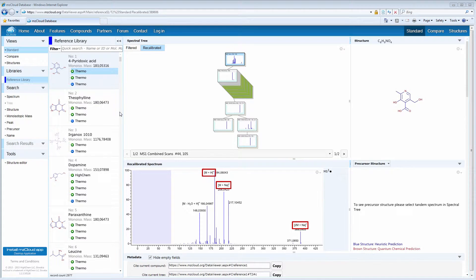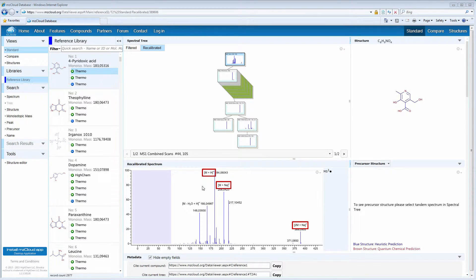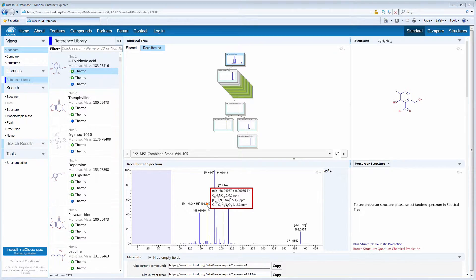In MZCloud, common adduct peaks are labeled, and if you move the cursor over a peak, possible molecular formulas will be shown.